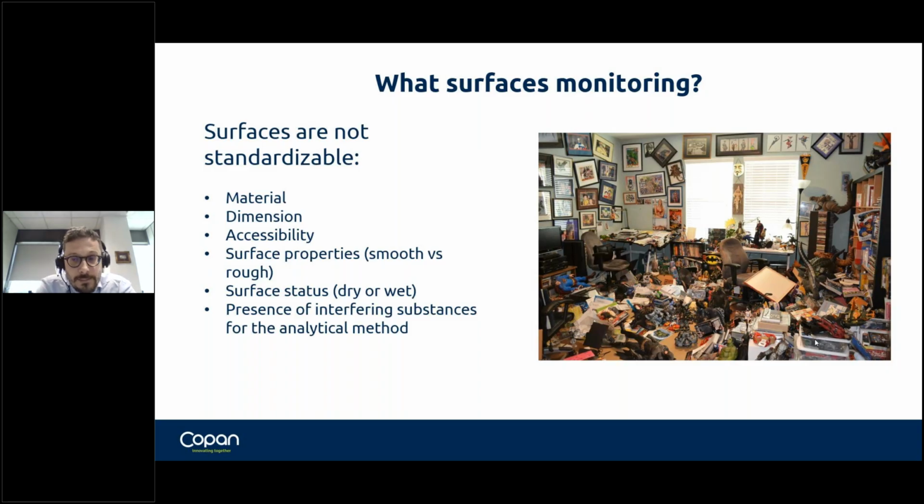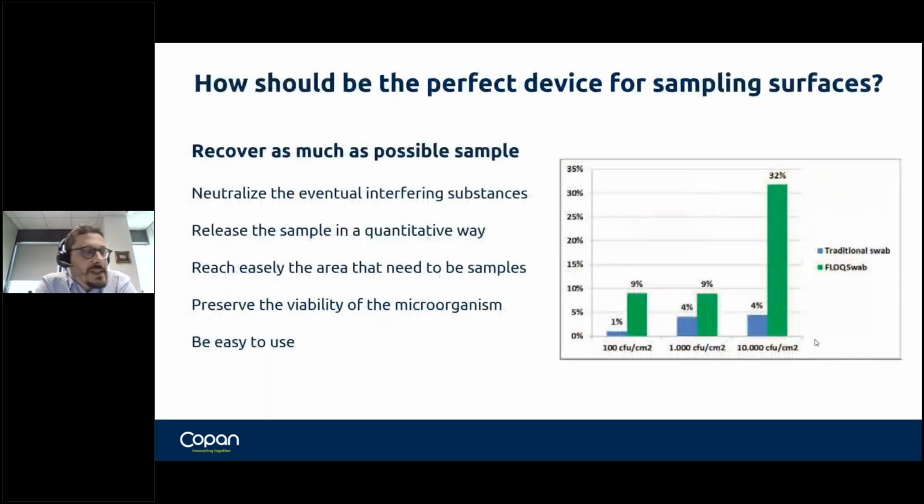Because if traces remain on the surface during the collection, then these traces can reactivate, so to speak, and reduce the viability of the bacteria that need to be cultured, negatively affecting the final outcome with a false result.